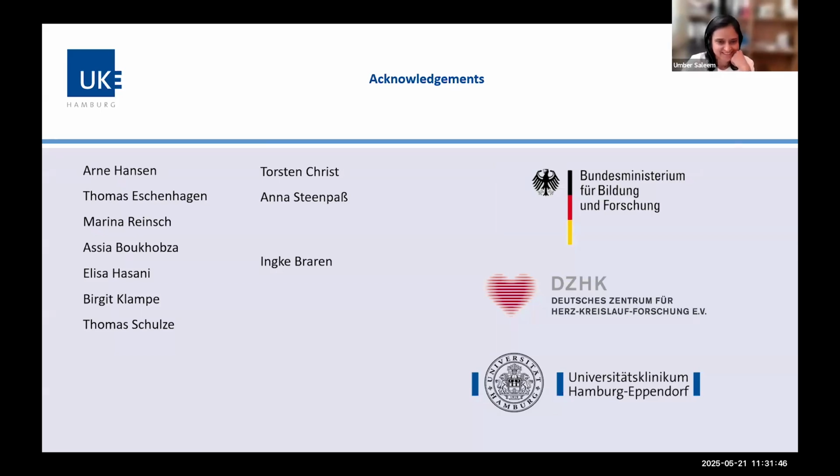Thanks a lot. It's great to see now that you can measure actually all the 3 functional assays in one model. So congratulations, first of all, from my side. Do you think that transduction for voltage indicators, so transduction of EHT, might be actually not damaging but stressing for the EHTs themselves? Have you ever compared this method with using a sharp microelectrode on the EHT using the same compounds? Would you see any difference?